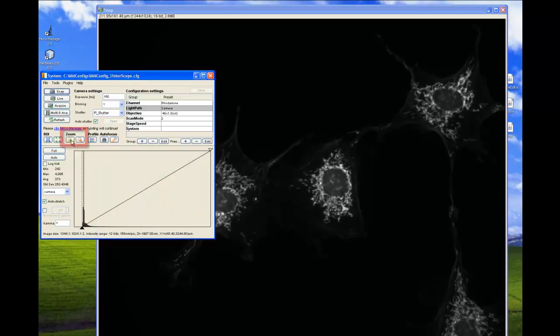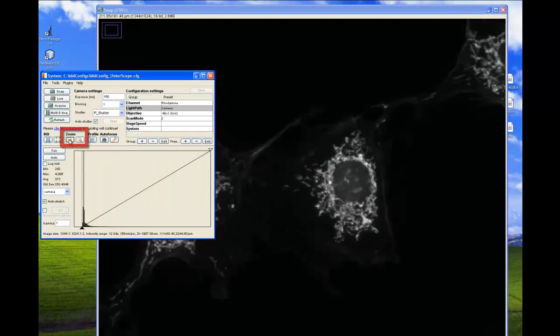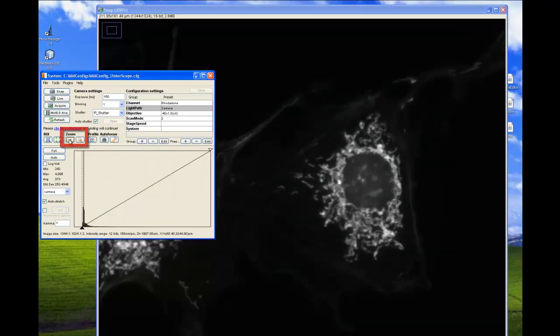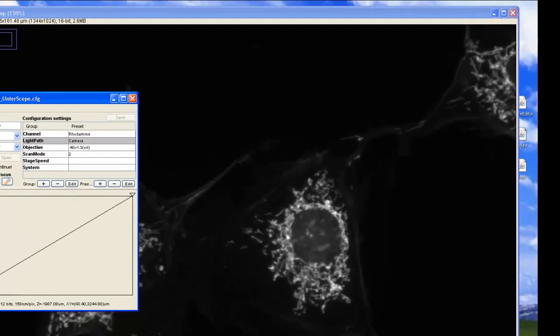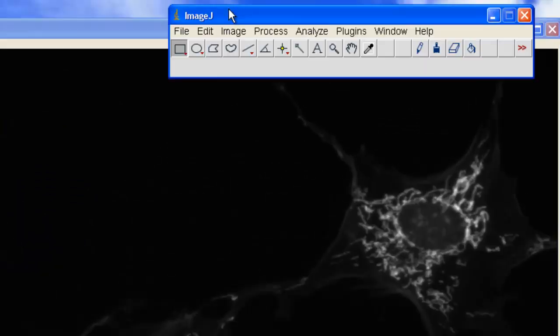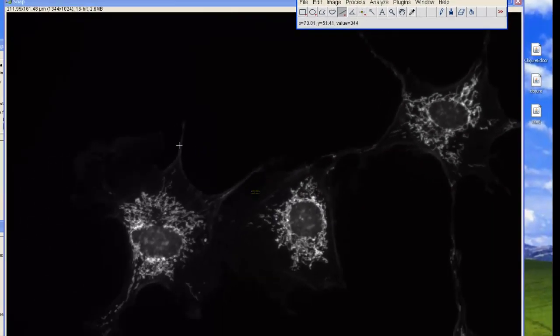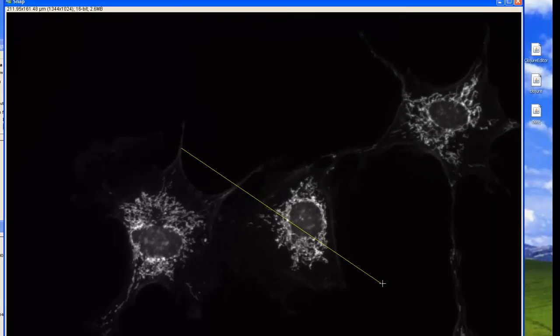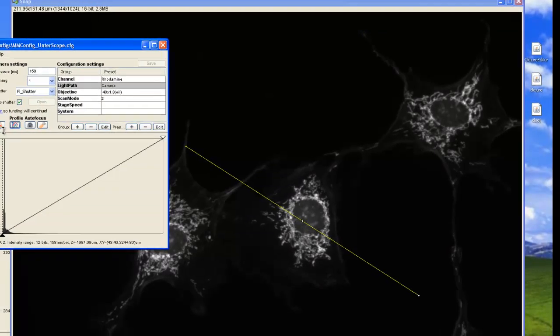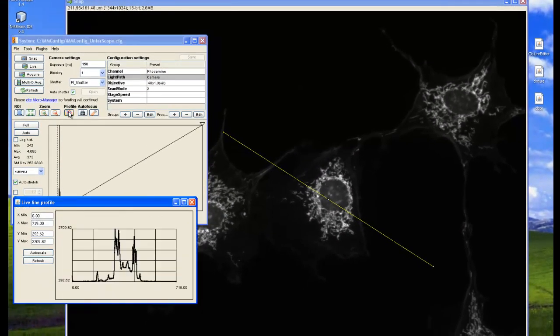You can also zoom in and out of the snapped image by clicking on the green and red zoom icons. In order to obtain a line profile, click the line icon on ImageJ and draw the line as you would like and then simply click on the profile icon.